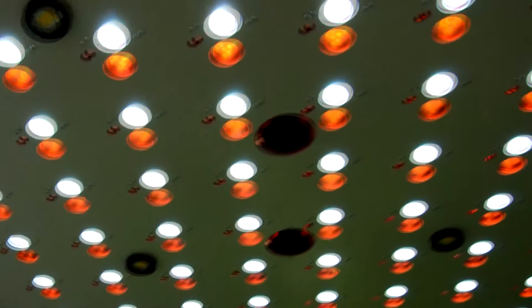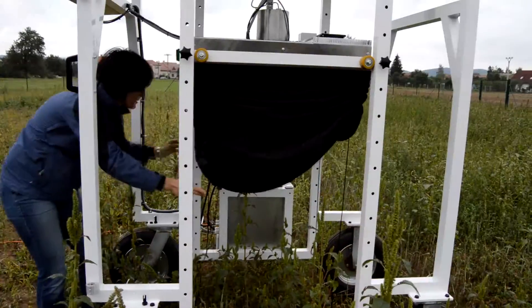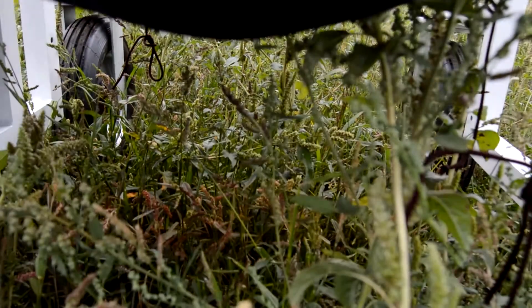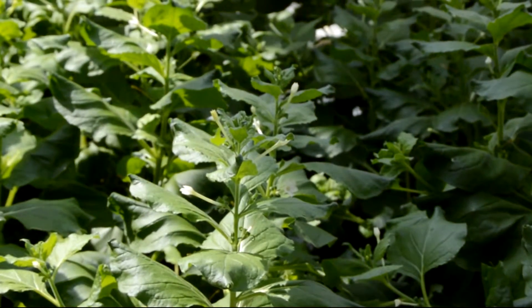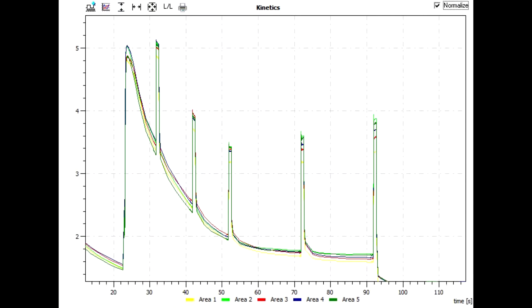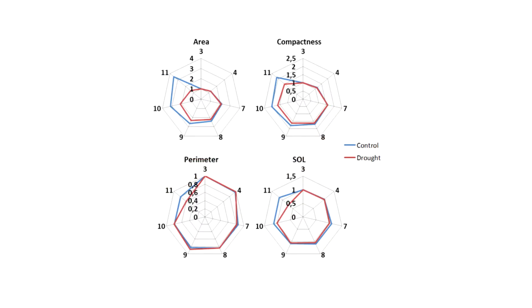The imaging environment with the high sensitivity camera and the LED light panels can be adjusted to produce conditions for both dark adaptation of the plant and various actinic light treatments. As an option, an additional camera for RGB analysis can be used, allowing both chlorophyll fluorescence kinetics data and morphometric data to be combined for the same sample.